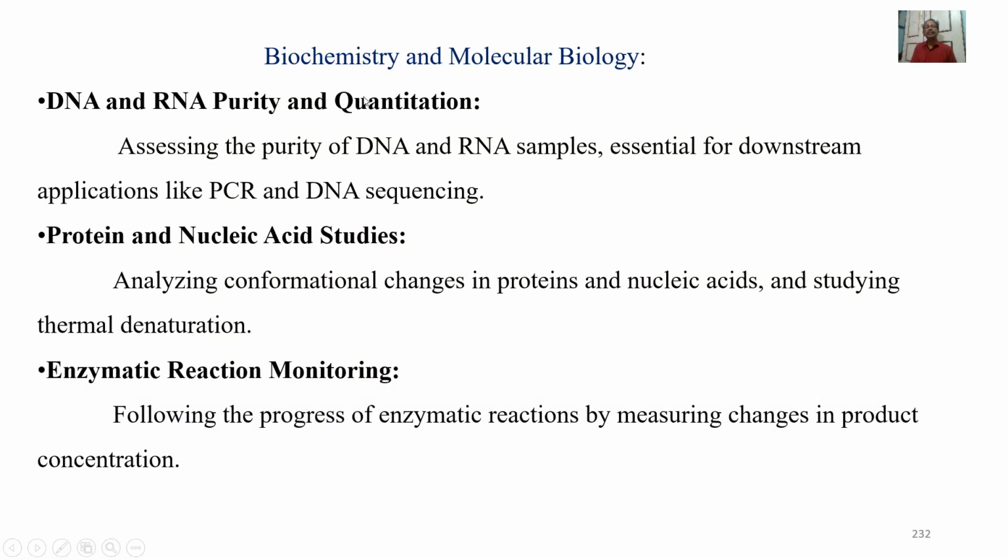Biochemistry and molecular biology. DNA and RNA purity and quantification. Assessing the purity of DNA and RNA samples essential for downstream applications like PCR and DNA sequencing.